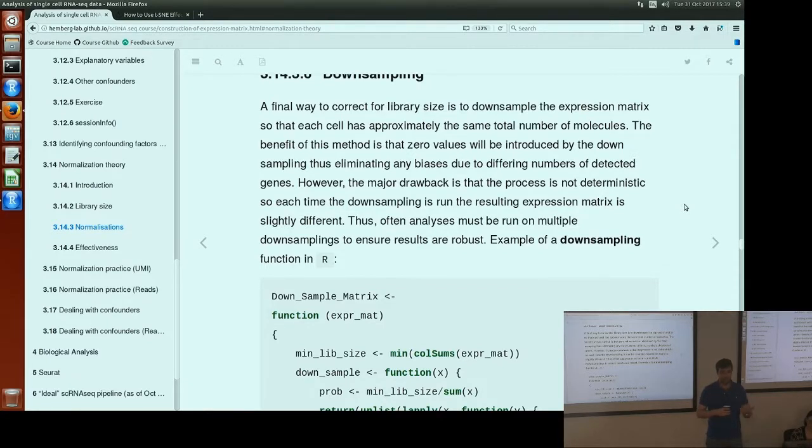And so that's one way that we can get to very sparse expression matrices in single cell data, even after removing obvious candidates like the dodgy cells and genes that have no information. So that's why these challenges remain even after QC and that sort of thing.